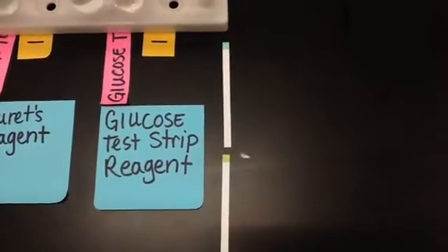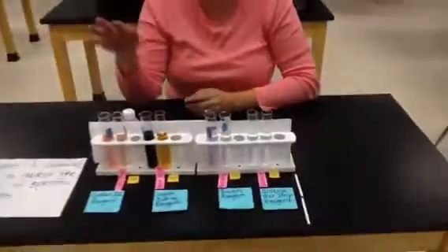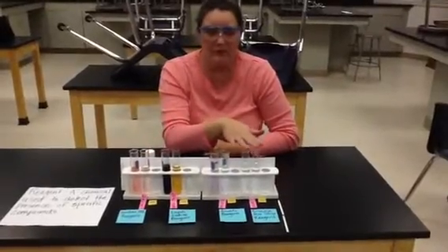So you guys are actually going to test your own unknown solution and find out what's in it. Does it have lipid in it? Does it have starch, protein, or glucose?